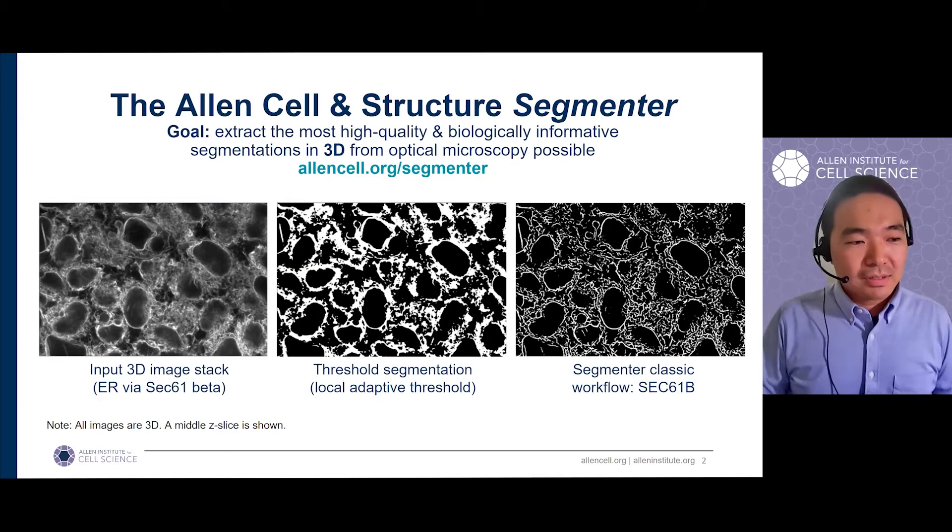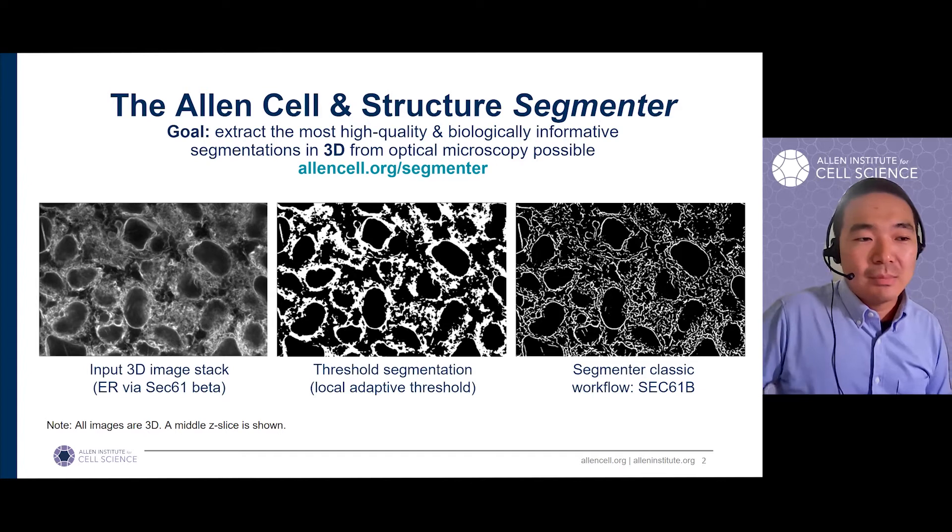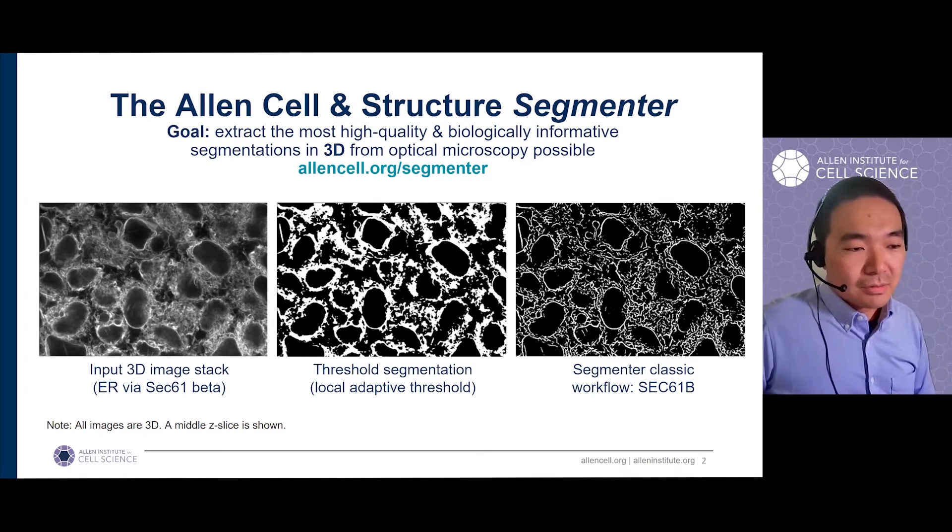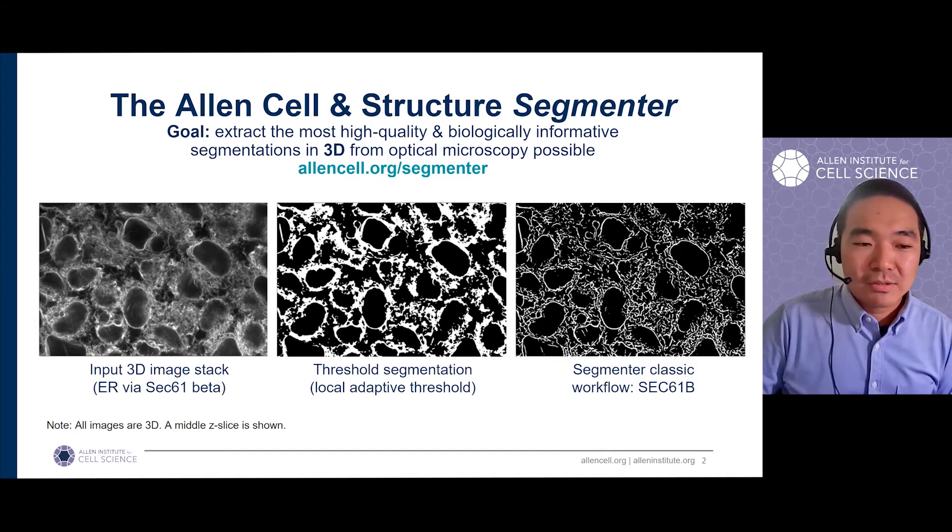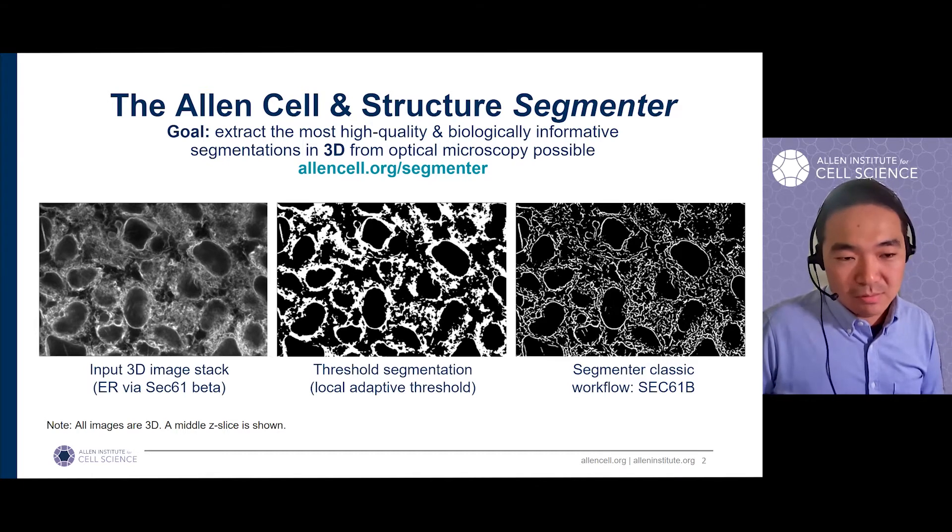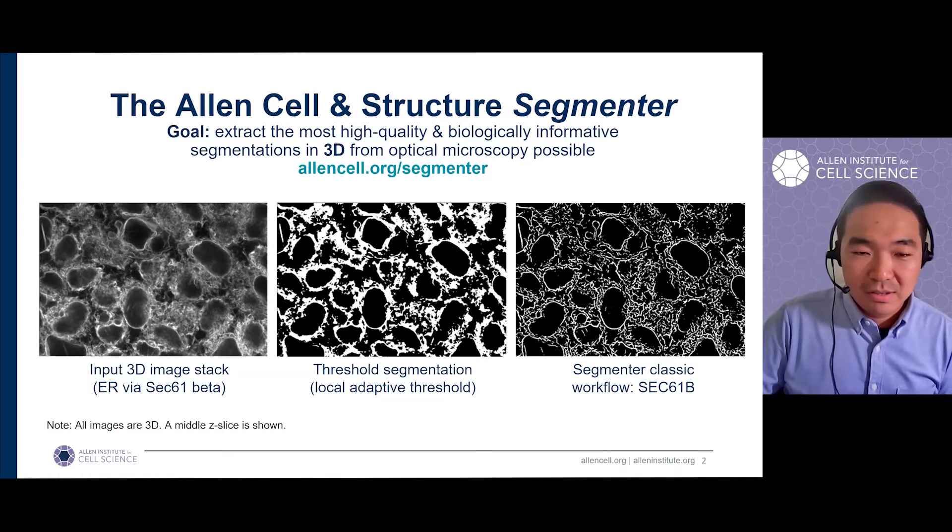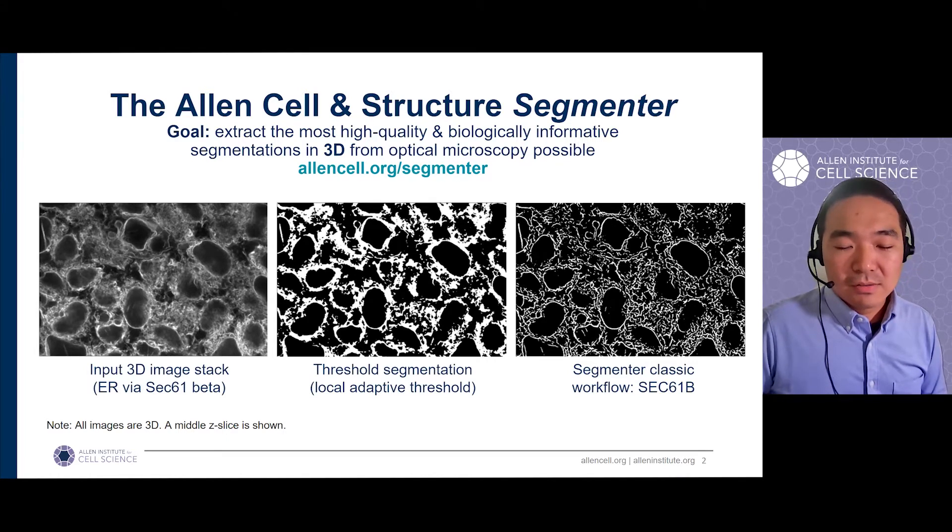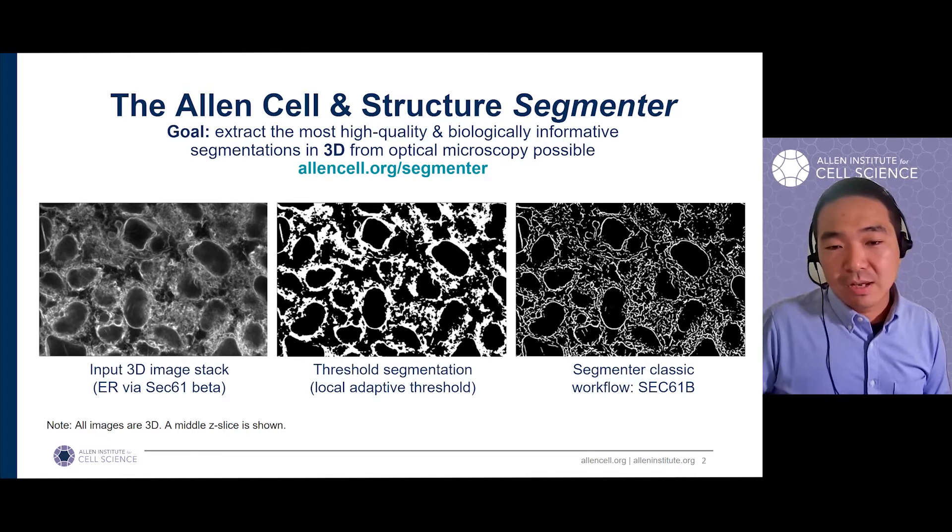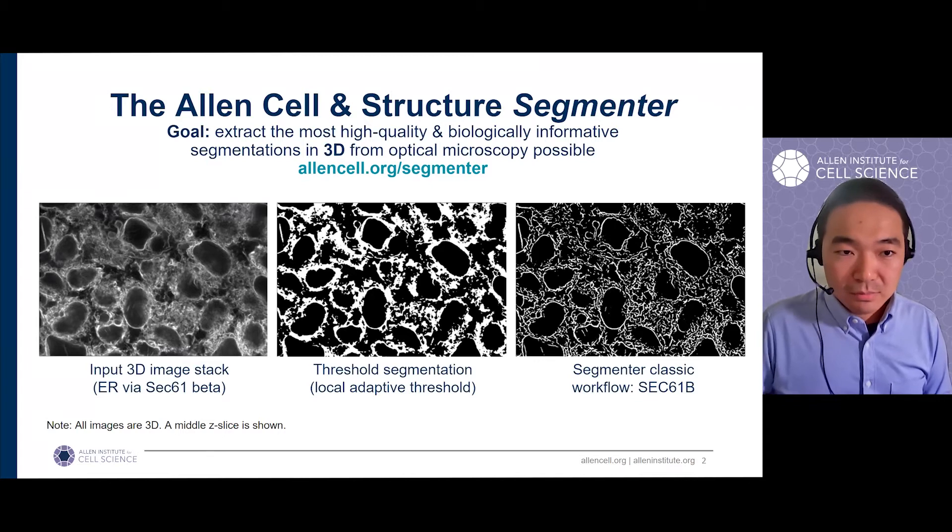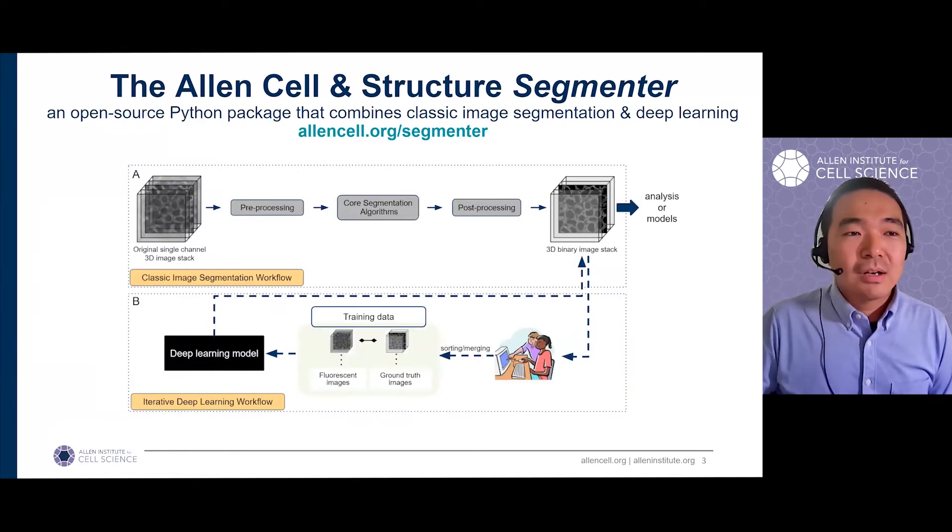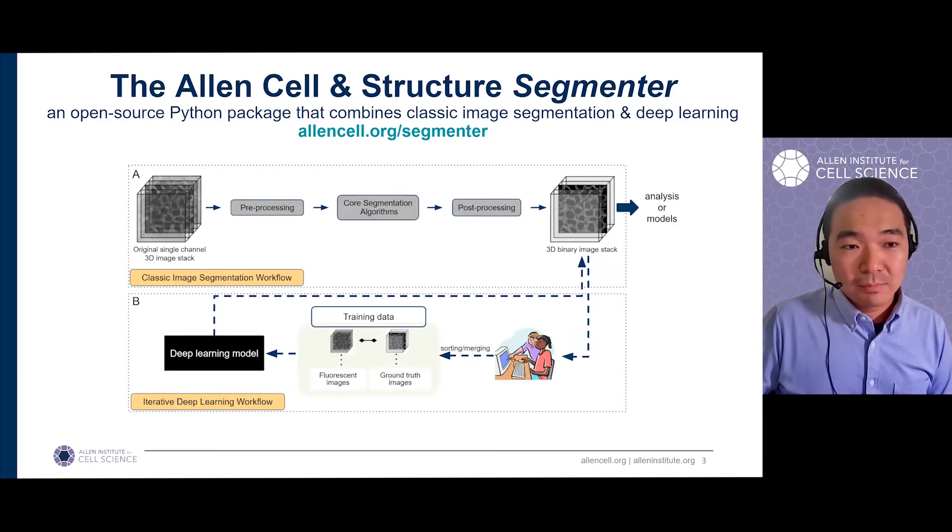So here is an example. Say, for example, you take an image on Zeiss spinning disk microscope as the input. A typical threshold-based algorithm may provide very poor quality segmentation as shown in the middle. But the current version of our segmenter will produce the segmentation as you see on the right from the same input image.